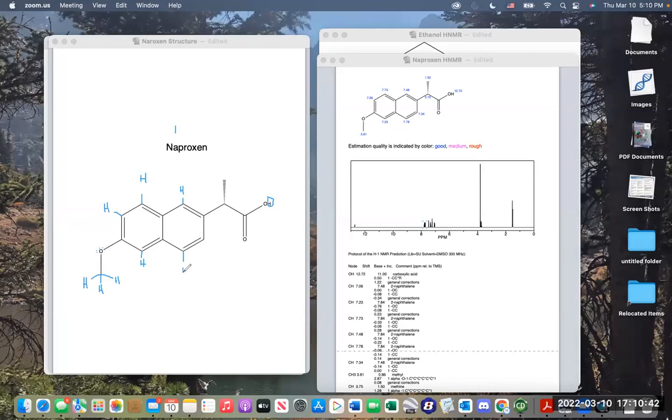here, here, and then this also represents a methyl group. So we'd have 3 coming off here. And then from this particular carbon, we would have another implicit hydrogen down here. And that takes care of our whole molecule. So we have 3, 6, 9, 12, 13, 14 hydrogens in total.